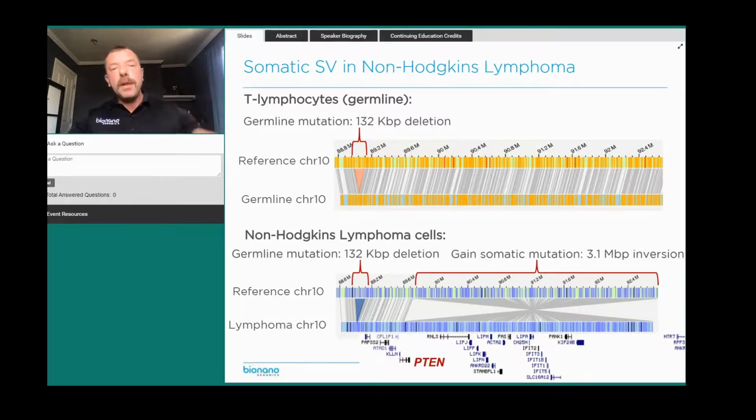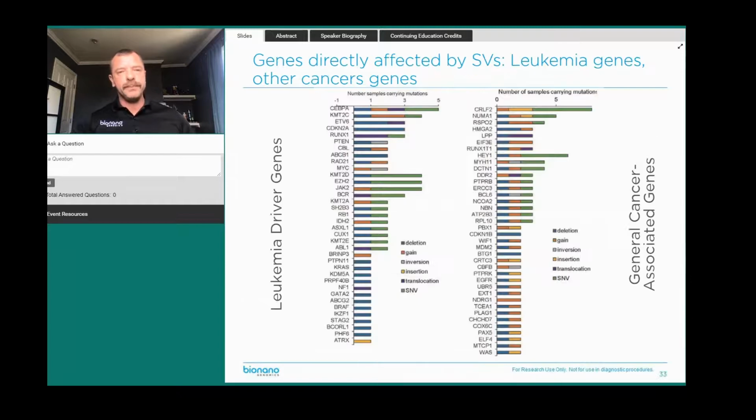The SNP in the other allele was picked up with sequencing. So here you have this combination where the Bionano optical mapping, or genome imaging, was really essential to find this variant that could immediately have changed the treatment for this patient.